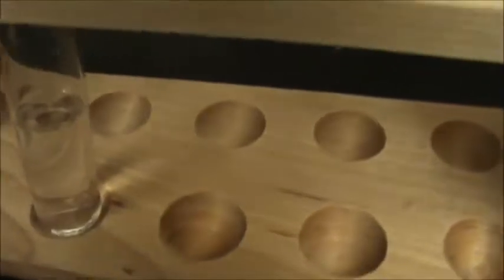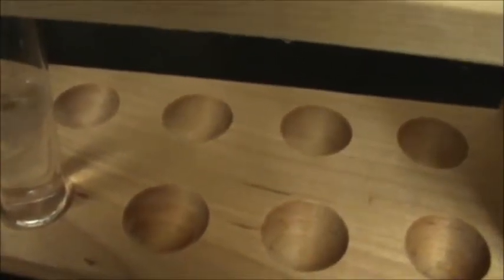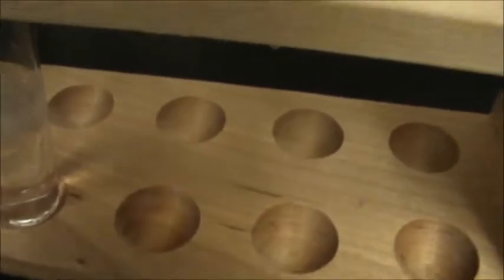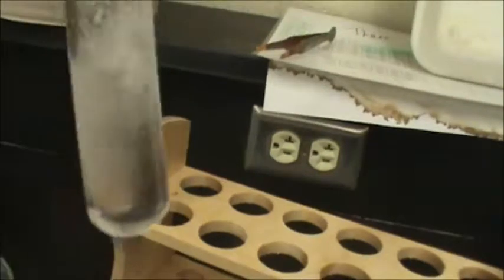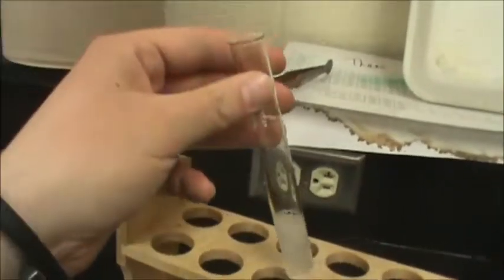Nothing's really happening at the moment, but when I add my 1, 2, 3, 4, 5. Whoops. Let's shake it up a little bit. When we shake it up, we definitely see, if we look closely, we definitely got bubbles going on. So I'm going to keep shaking a little bit more just to mix up the catalyst with my chemical. And I'm going to mess with a wooden splint.